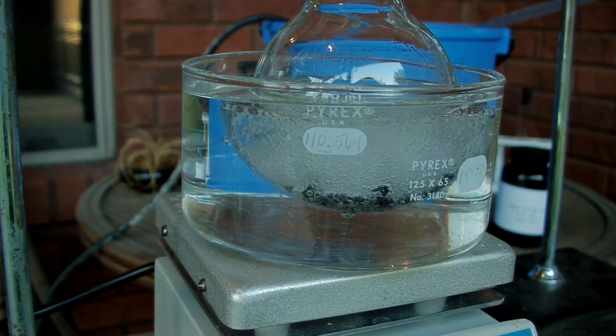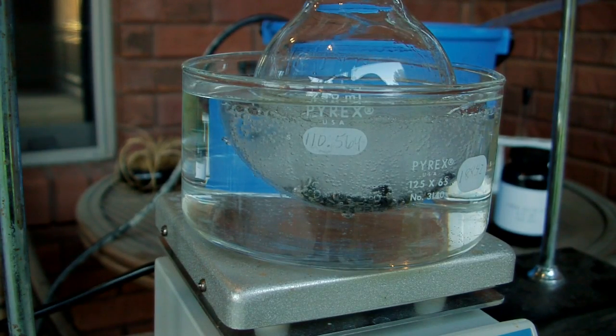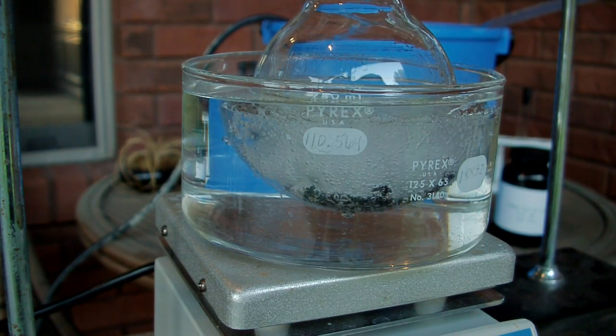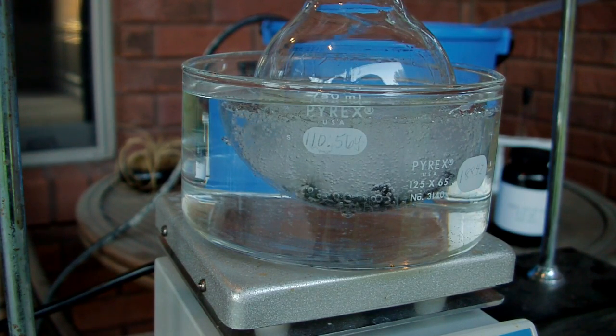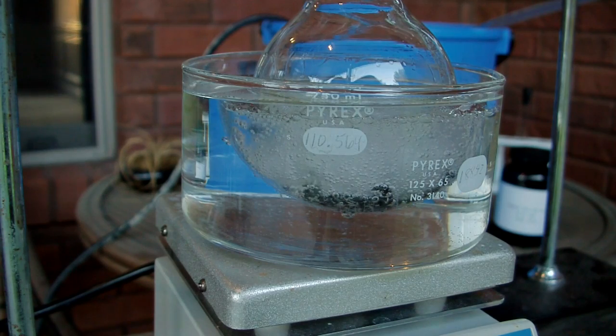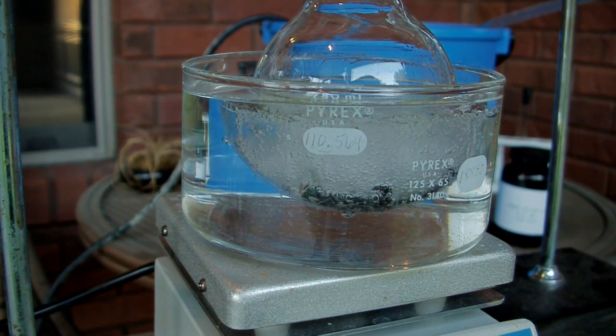So in no time at all we're getting a little bit of boiling going on. The dichloromethane boils at about 40 degrees Celsius and methanol is 65. So that should be enough of a difference so that simple distillation will work.